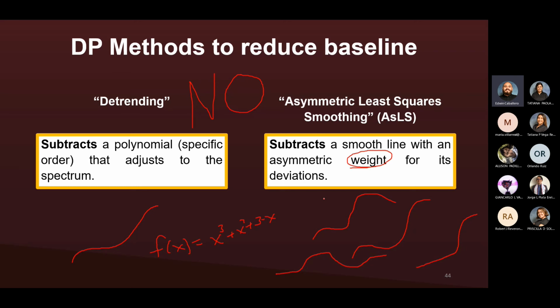So in this case, it might constitute a lot of tampering with your data. It's simply too much tampering. What I would recommend is using this for aesthetics. If you want to simply show a spectra, then you can just say at the bottom, yeah, this was corrected with baseline correction, and you show the spectra just like it is. But do not use it for models.